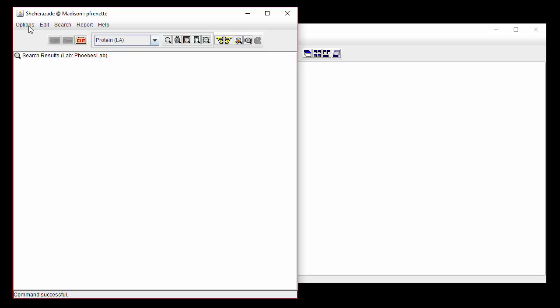Lab protocols are a library of shared, experimental, laboratory protocols that describe different procedures in detail, like cloning, expression, purification, sample preparation, etc. This is the first of a few videos about using lab protocols in Sesame. This video covers the basics of building a lab protocol.